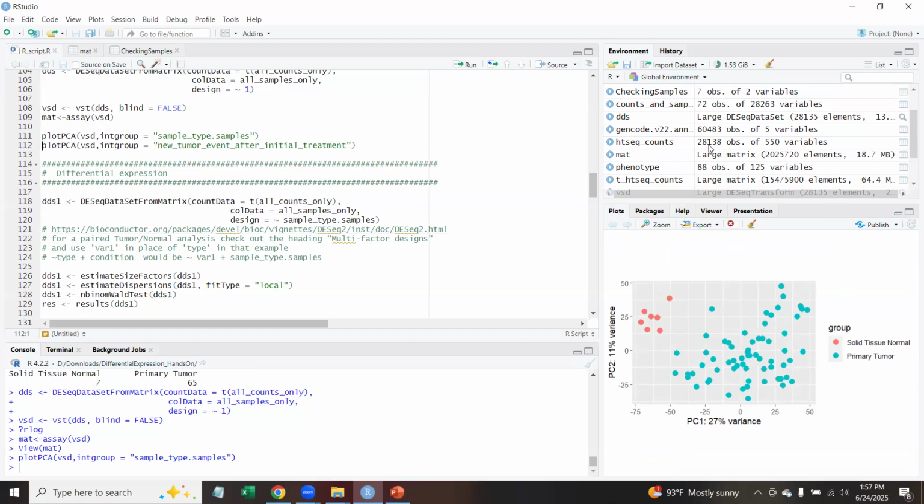And principal components analysis is going to consider all of those measures and smush it down, condense it down into a few dimensions of variability. This is a dimension reduction analysis because we're smushing all the measurements together into the main sources of variation.